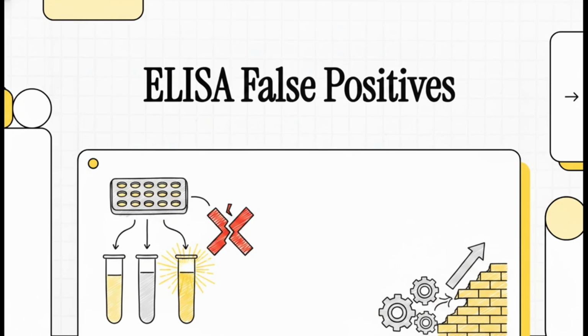Look, let's start by talking about a lab reality we have literally all faced at one point or another. You've spent months optimizing an ELISA, you've carefully selected your antibodies, dialed in your standard curve, and everything looks absolutely beautiful on the bench. But then, you move to testing real study samples and you face the crushing frustration of unexpected false positives in your negative samples.